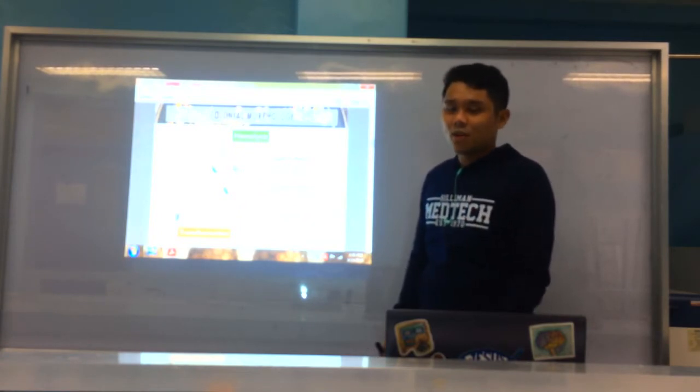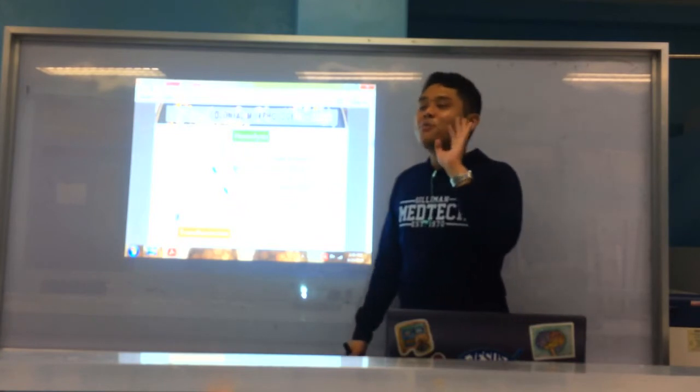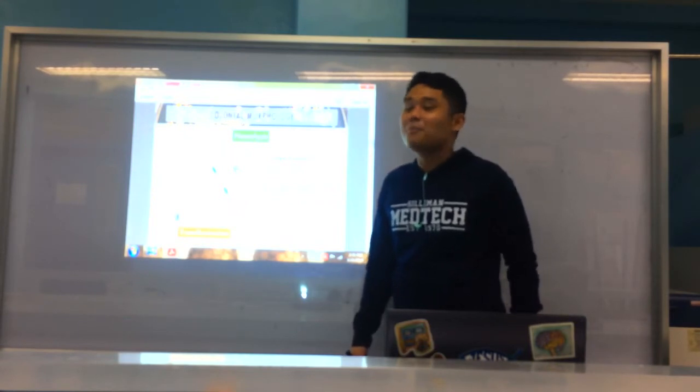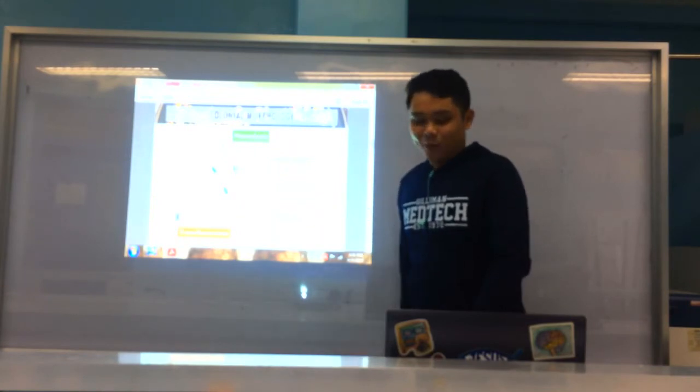evaluate hemolysis. Okay? Again, blood agar plate. If a question asks on what culture medium we observe hemolysis and you answer chocolate agar, that's wrong, I'd be very upset, joke. Okay, alright. So that's for hemolysis.